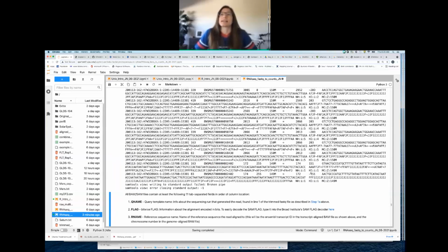Then let's take a look at this next mate pair, and already we can see just by the insert length that we have a different insert length, which is going to be a pretty good indication that we have a different read pair. And then just to check, looking at that sequence compared to this sequence, of course looking at the whole sequence is kind of cumbersome, so I really just take a look at the first few base pairs, and usually they're different within the first few base pairs. So this one starts GTC, and this next one here starts GTAA. So indeed, that's a different read. And so now we're seeing a different place.